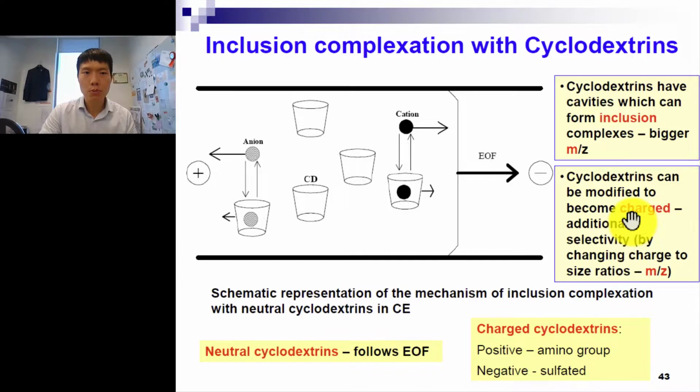So one thing is, right, we do an inclusion of complexation using a chemical called CD. CD is short for cyclodextrin here, right? So it feels like a cone-shaped particle. It has a cavity, imagine like a pail, right? There's taper on the side, but it's hollow basically because it allows your substrate to go through, right? But using also the size exclusion principle, you need to look at the size of the CD so that your substrates can go through and not be stuck there.